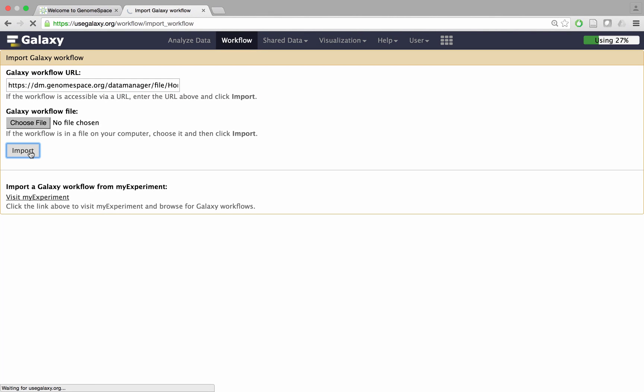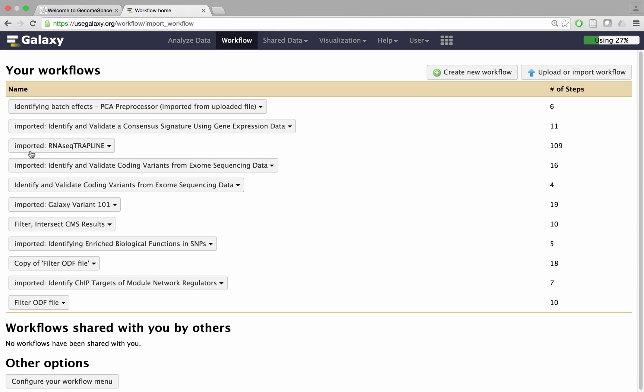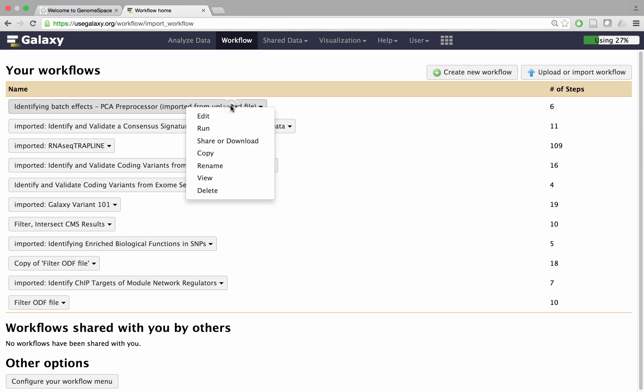You will be returned to the main workflow page. The workflow should now appear in your personal list with the suffix imported from uploaded file. Click the workflow followed by run to begin using it.